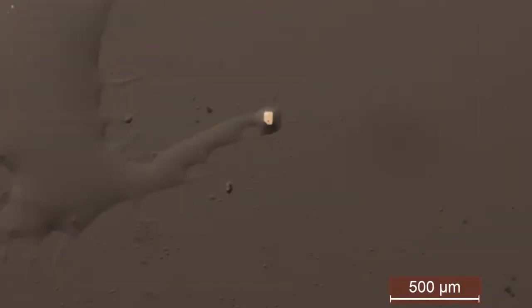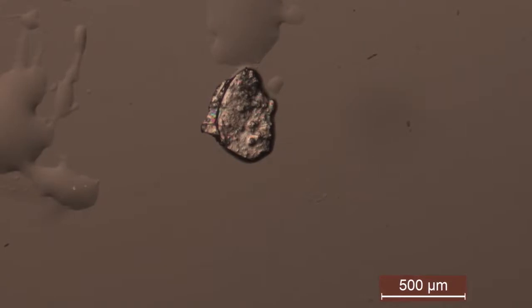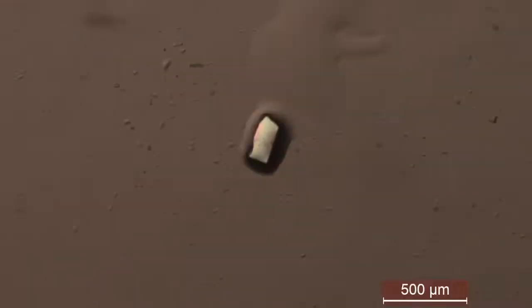The first crystal is exceptionally small and will be weakly diffracting and not a good choice. The second crystal is definitely not single and is made up of more than one crystal. The third crystal is cracked and unsuitable. The final crystal would be the favorable one to use.